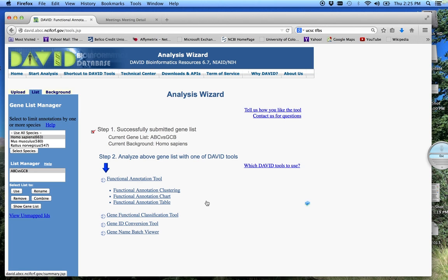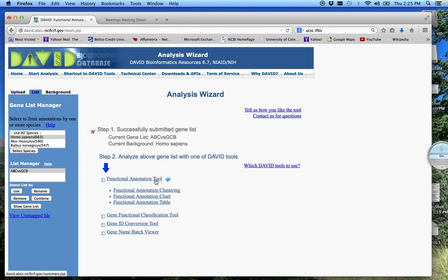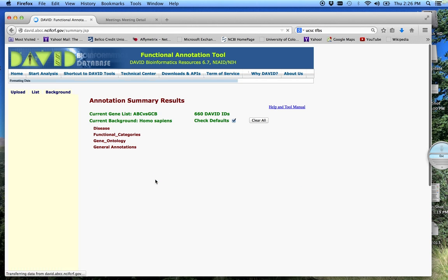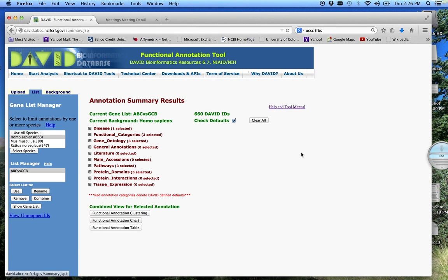Today, we're going to explore our list using the Functional Annotation Tool. We're no longer in the gene level phase. Now we're looking at how these functional categories organize themselves. So I'm going to click on this tool here, and it'll bring us to this window.